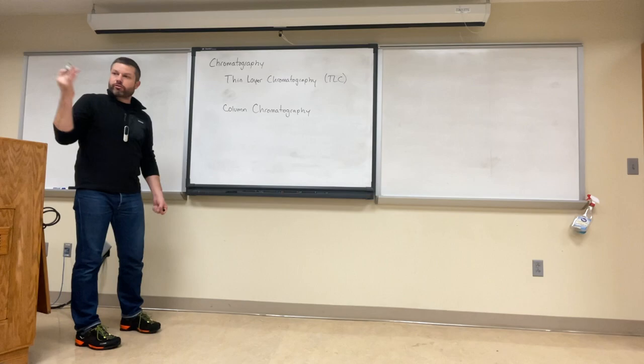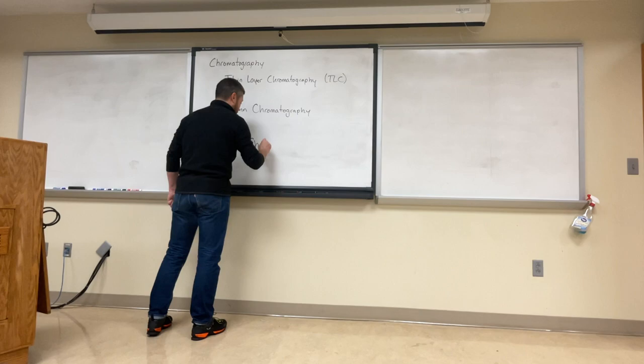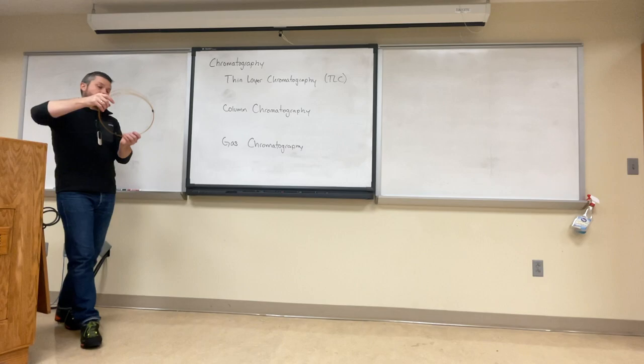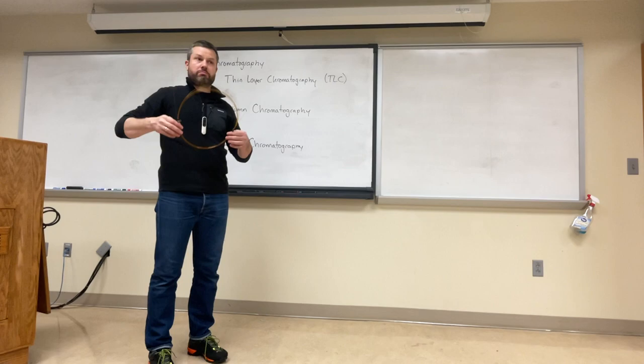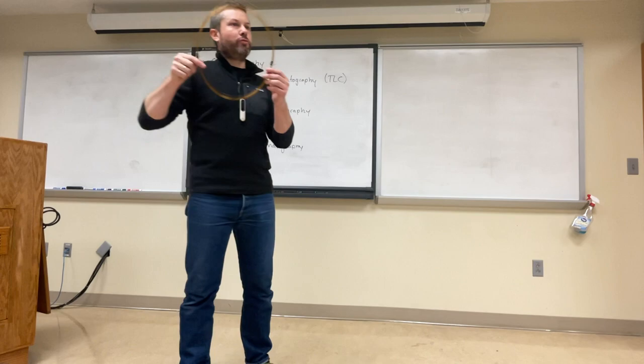We've also seen a third type of chromatography, or you've been introduced to a third type, that we can use to understand the other two, which is gas chromatography. They all more or less operate the same way. When you learned about gas chromatography, you learned how molecules are injected into the GC, the gas chromatograph, and they flow through a column, and how they interact with the packing material in that column determines how fast they move through it.